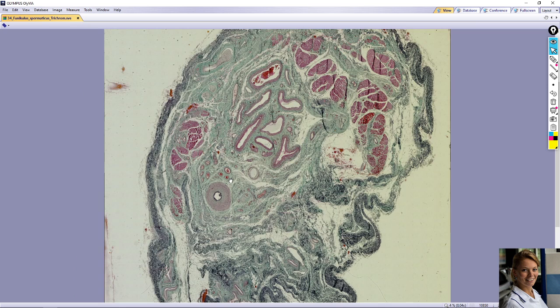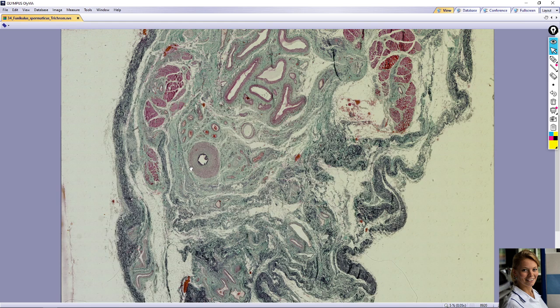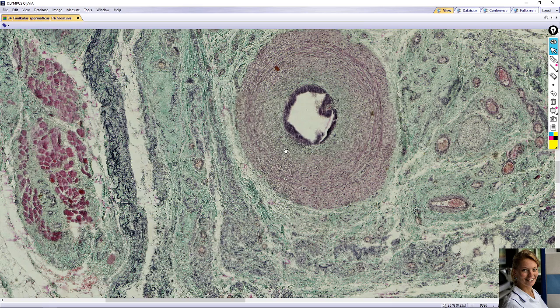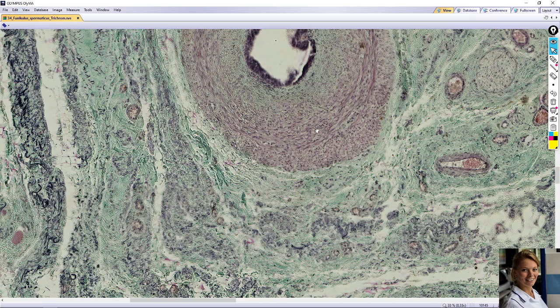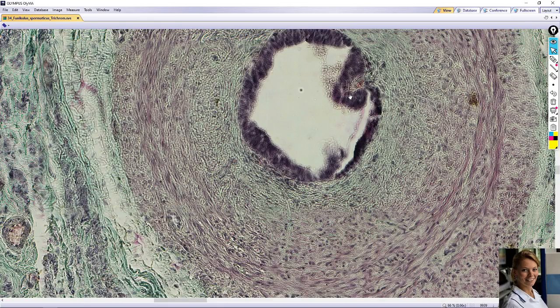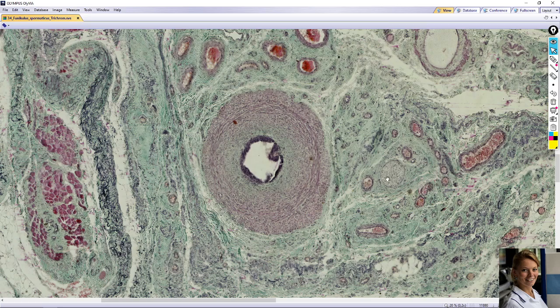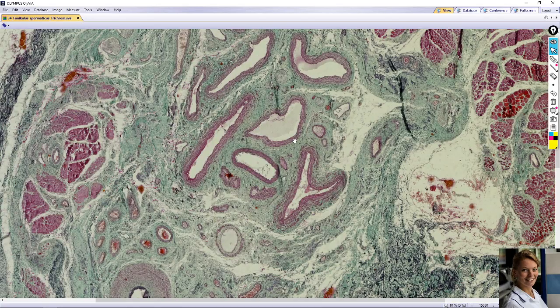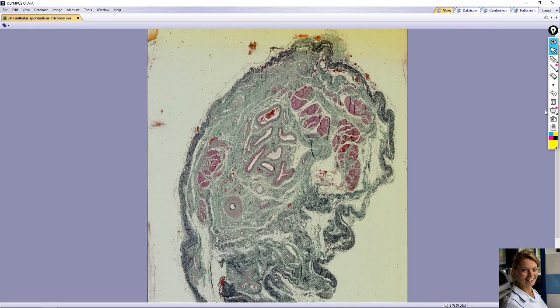That's all for the spermatic cord, which contains vas deferens with a very thick muscular wall. You can find three directions of the muscular cells: inner and outer are longitudinal direction and middle is circular direction. The lining epithelium is pseudostratified columnar epithelium with stereocilia. You can find nerve bundles, skeletal muscle, and the very typical pampiniform plexus and testicular artery. Thank you very much for your attention.